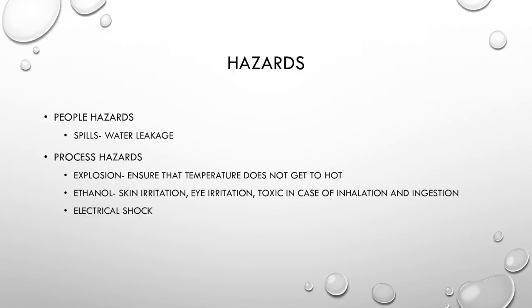Also be careful that the temperature of the column does not get too hot, as we don't want any explosion of glass. Ethanol is not for consumption, nor is it very good for your skin or eyes, as it is an irritant. Also beware of any electrical shock that can occur from the mishandling of the heater or spills that occur around the heater.